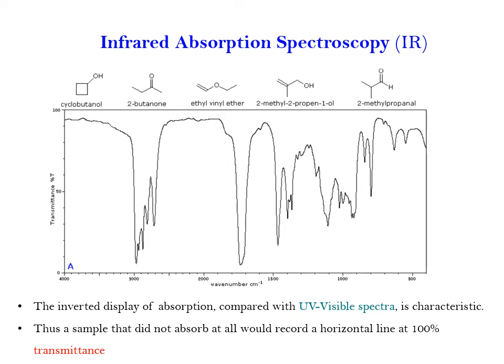So this FTIR spectroscopy is used in organic synthesis, polymer science, petrochemical engineering, pharmaceutical industry, or food analysis. It has a wide array of applications, from monitoring processes to identifying compounds to determining components in a mixture. So this is a specific absorption spectroscopy for different molecules.